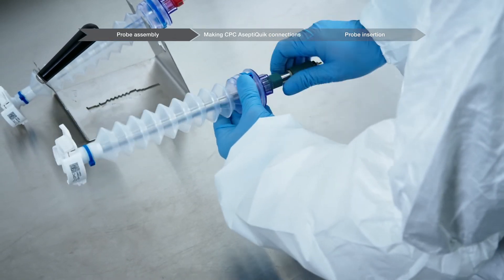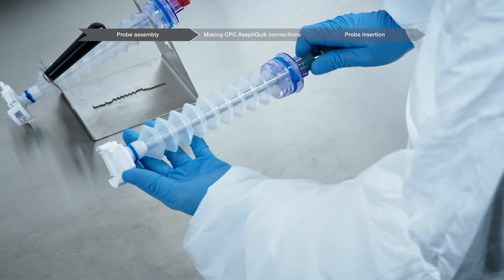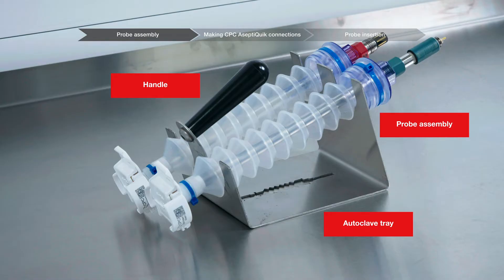Place the probe assembly with probe into the autoclave tray for probe kits. The stainless steel autoclave tray for probe kits holds the electrochemical probes and bellows in place during the autoclave sterilization process. It features a plastic handle for easy transport, positions up to two probes on a 15% incline for greater probe and membrane longevity, and will restrain probe bellows from collapsing during sterilization.